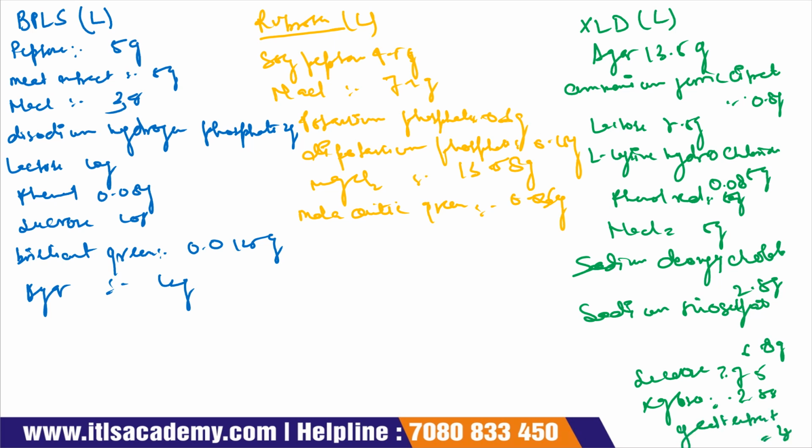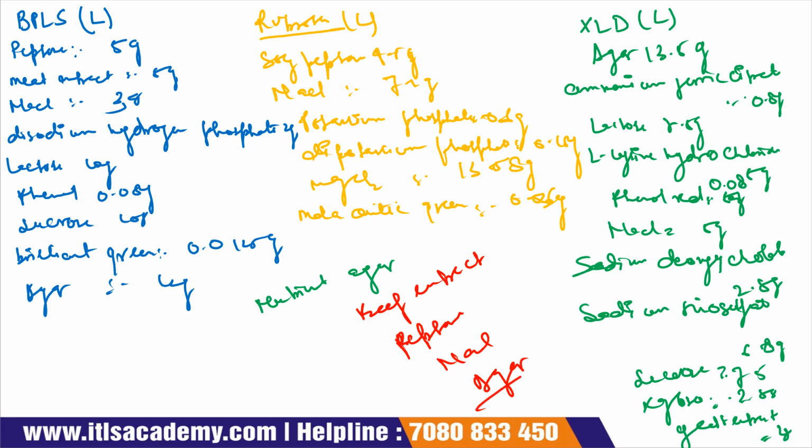Now the next composition is nutrient agar, that contains beef extract, peptone, sodium chloride and agar, and the composition we have already discussed.